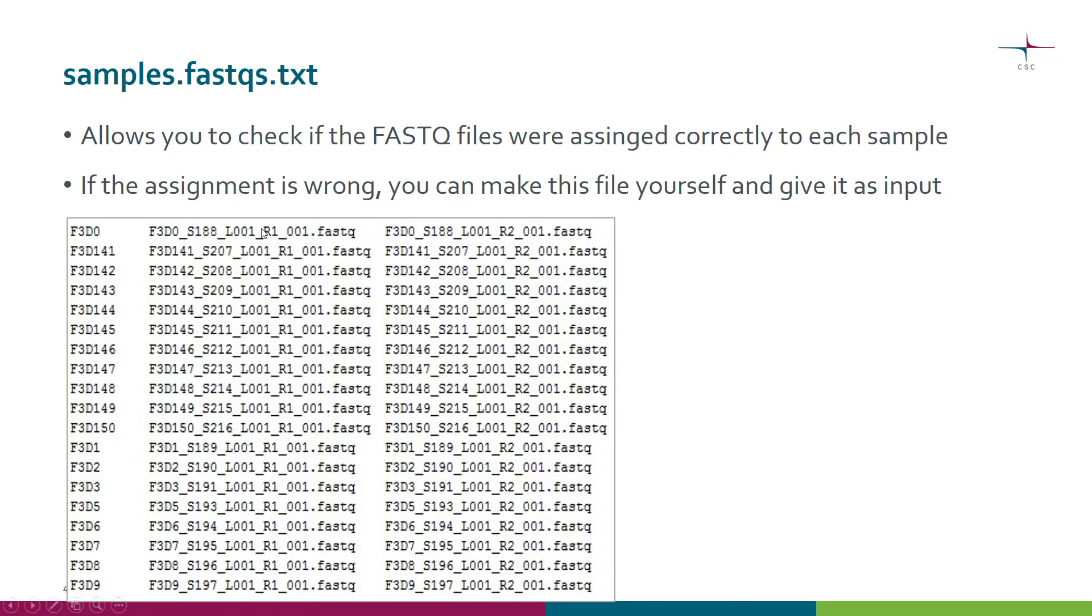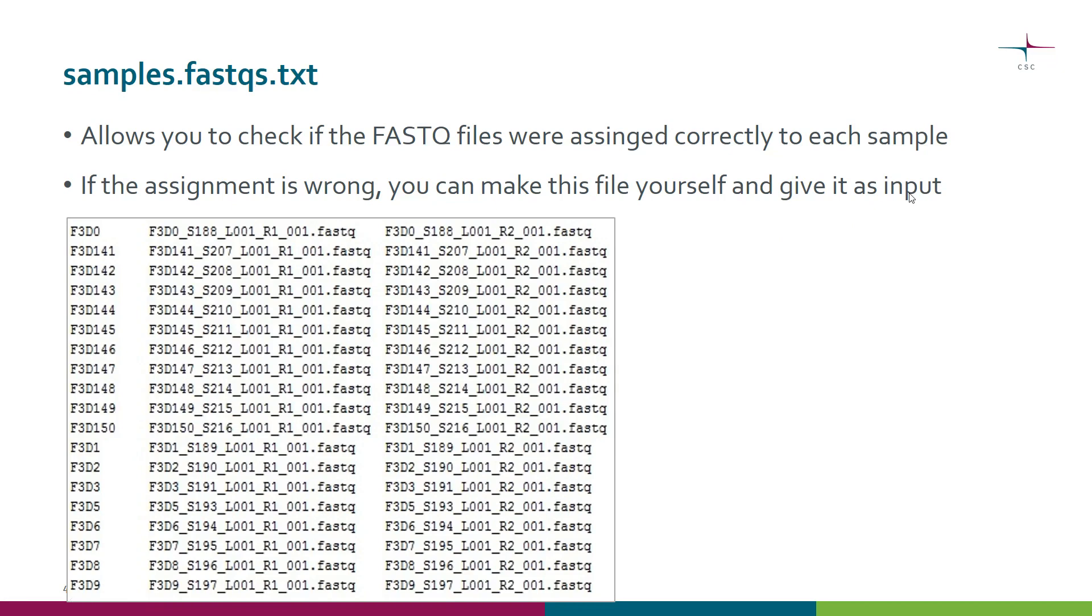We had the R1 file for this sample and the R2 file for this sample. If you spot a mistake here, you can make this file yourself - it's just a normal text file - and then you can give it as input to ensure that the pairing is done properly.